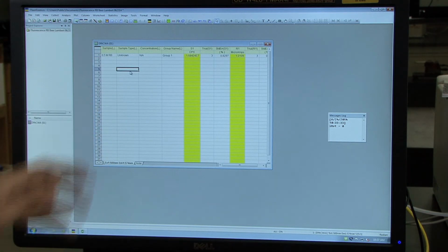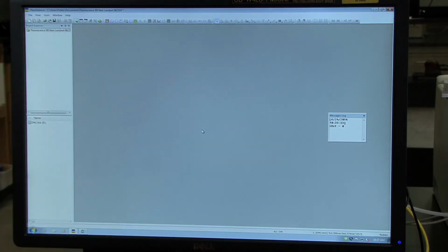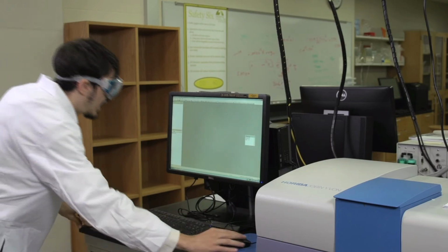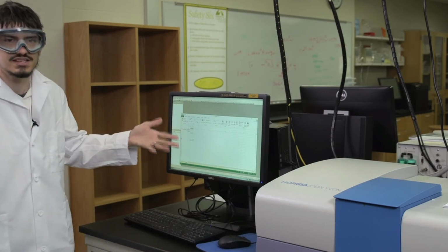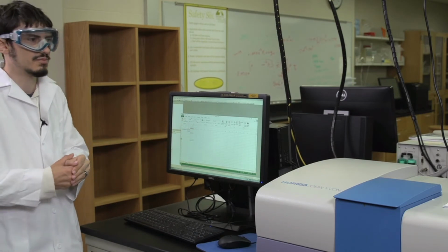Then you can just leave that there, click the X and click hide or simply minimize, and the data will be hidden but on the left of the screen and accessible later. Repeat this for all of the other samples for the Beer-Lambert study, and you will have enough concentrations and intensities to construct the Beer-Lambert plot, which is necessary for carrying on the later parts of the experiment.